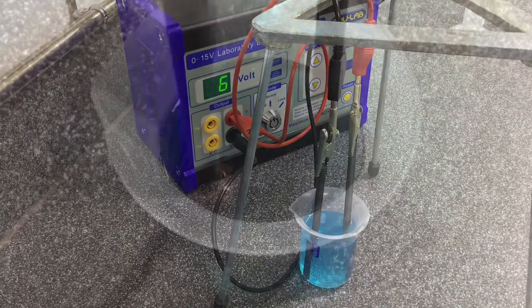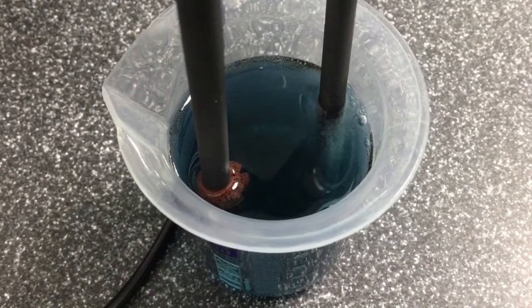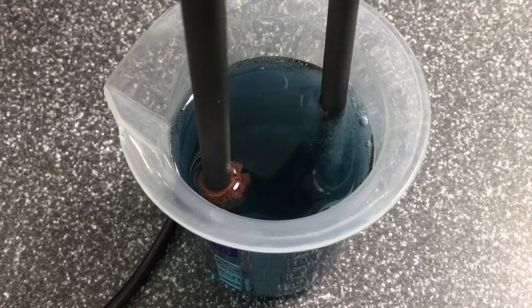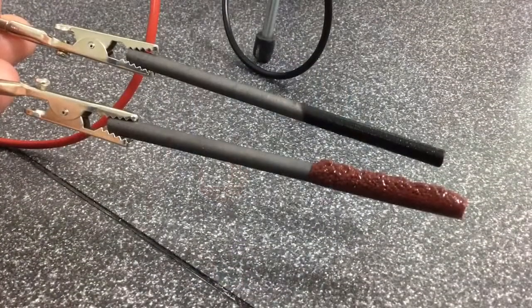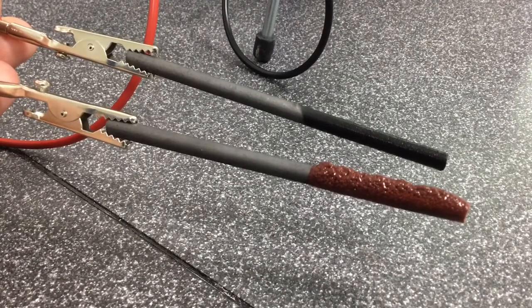It is at this point that electrolysis occurs, with the copper sulfate solution being decomposed and copper ions gathering at the cathode to form pure copper. At this point the electrodes can be removed and dried, and you can clearly see the buildup of copper on the cathode.